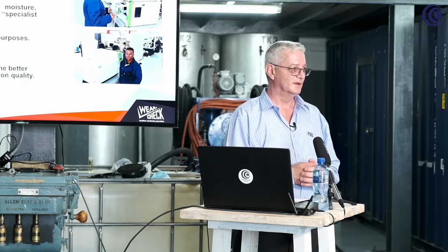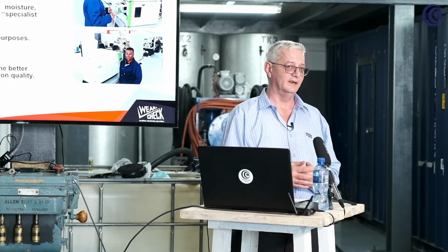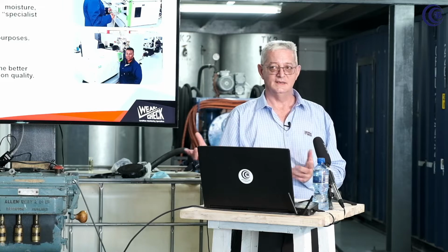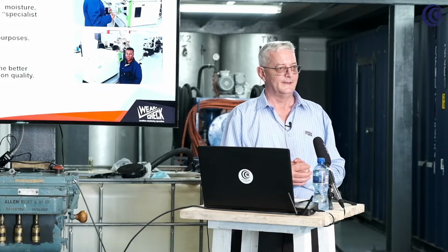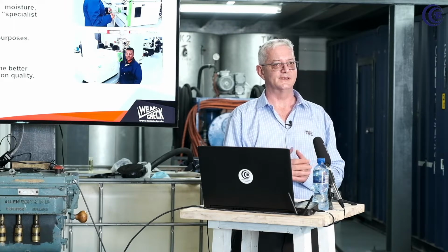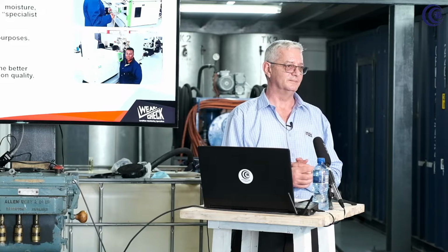And if you look at the transformer lab, in the past you could start transformer labs out of a single garage. You had a couple of instruments and it was good enough to do the testing. Nowadays, our laboratory in Joburg is about the size of this floor area here, a bit bigger than this. Durban is bigger than this, and our Cape Town lab is about half the size. There's now new instruments, different instruments, and every 5 years we need to update our instruments and look after it. The client wants an accurate result. We can only do it with top-of-the-range equipment.